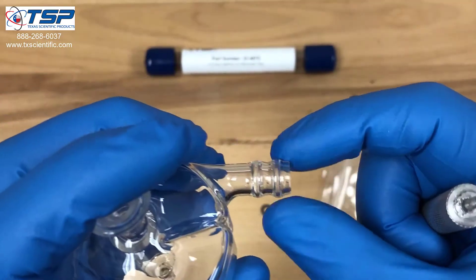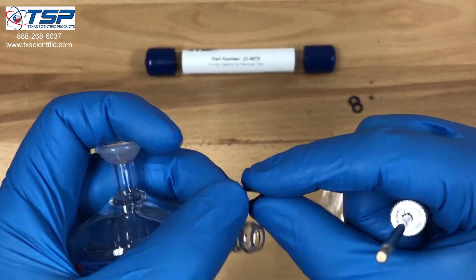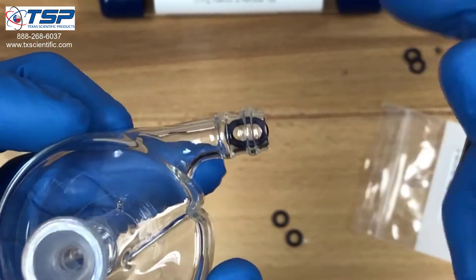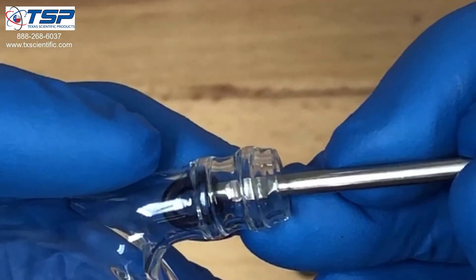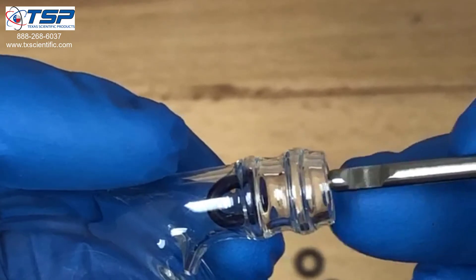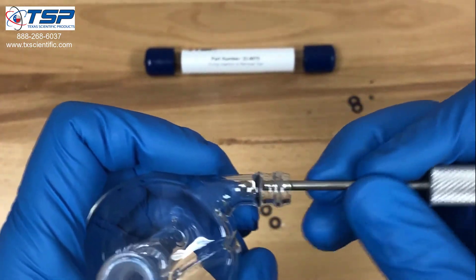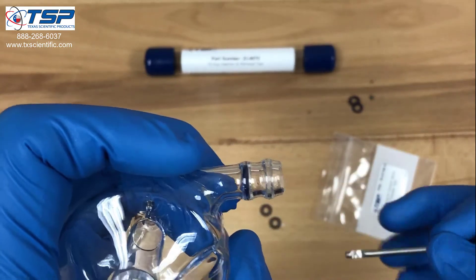Normally it would be difficult to get an o-ring into that position without a tool like this, but in this case we can take the o-ring, squeeze it a little bit, insert it into the spray chamber, and use the blunt end of the tool to push it down to the recessed area. For the second one, you can push it in and use the notch tool to pull it towards you. I like to take the o-ring tool and just make sure that the Viton o-ring is seated properly.